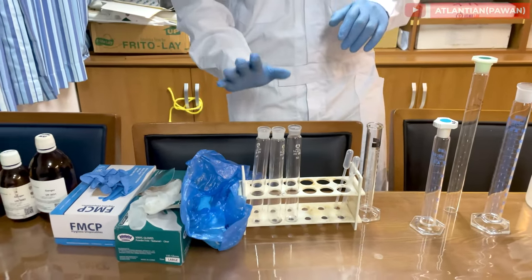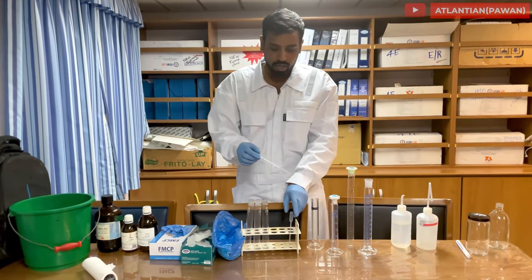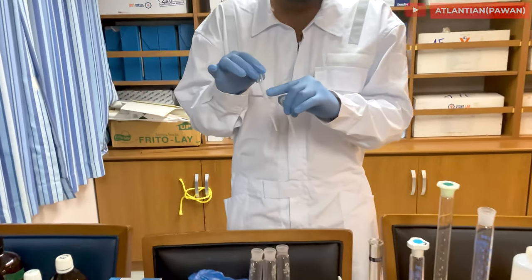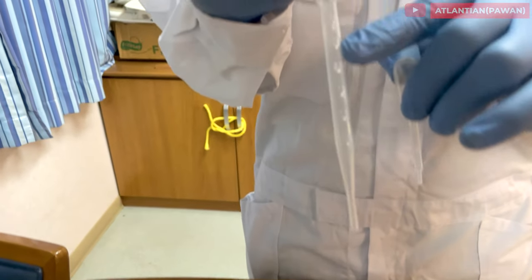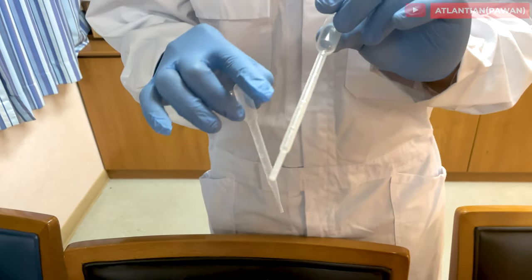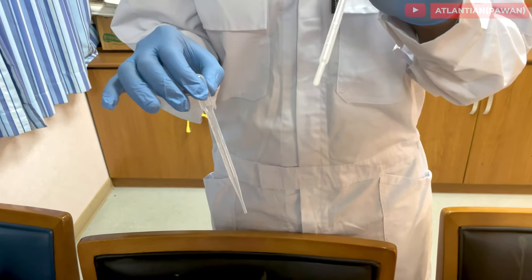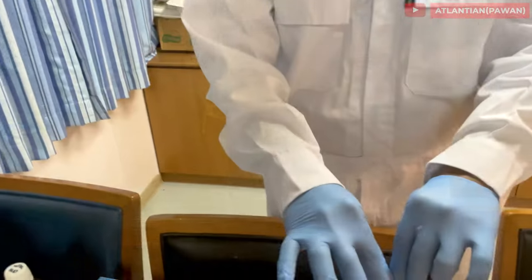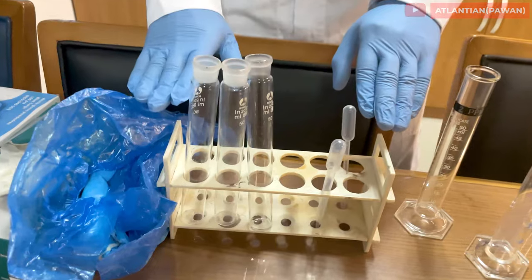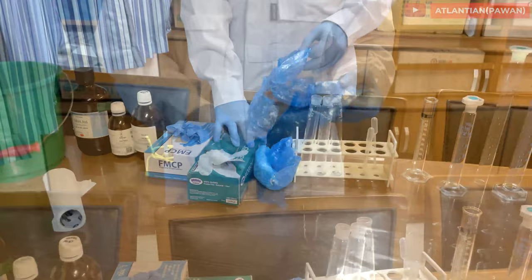A 50 ml bottle is more than enough to do any test — chloride test or hydrocarbon test. Next are pipettes. Make sure you have pipettes with graduations: 3 ml, 2.5 ml, 2 ml, and so on. A 3 ml pipette is much more useful than a 1 ml pipette. You must also have a stand to keep your test tubes.